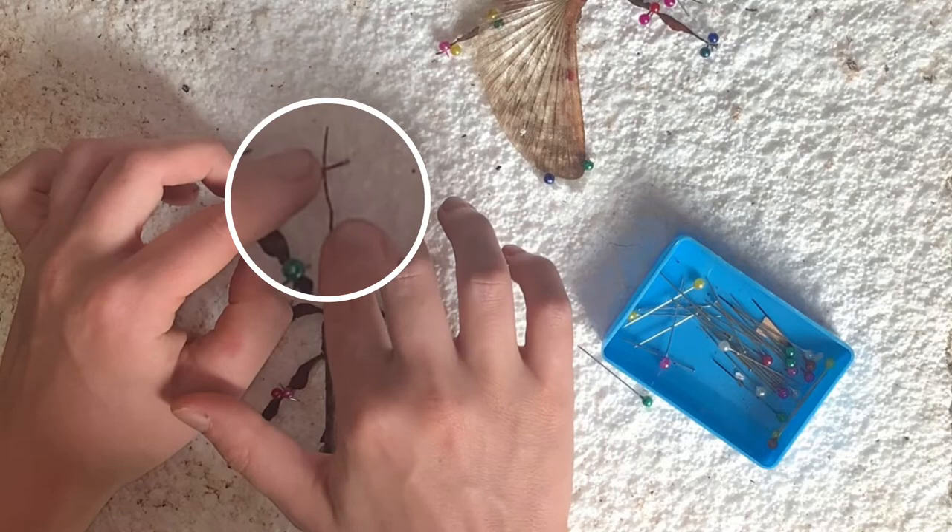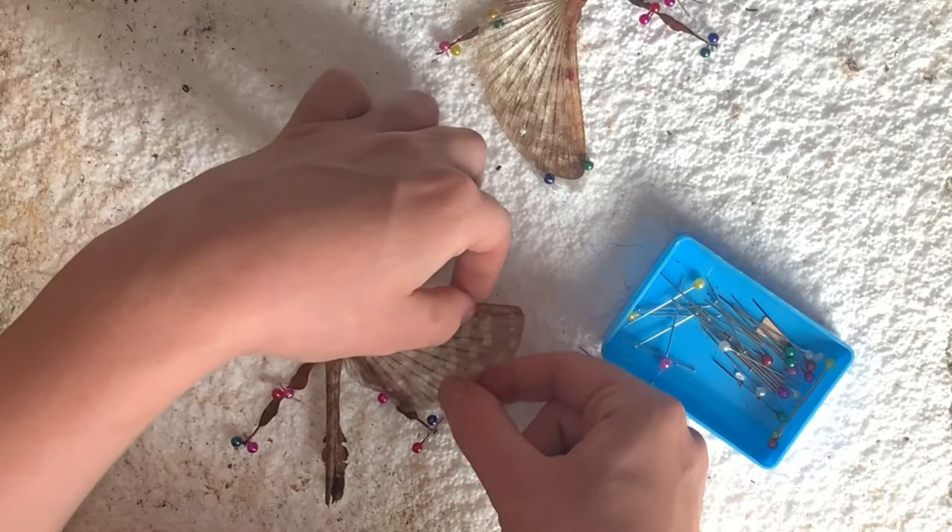Now that the antennae are pinned, we can move on to the wings. Start by stretching out the wing and then placing a small bit of styrofoam underneath the very end of the stretched out wing.